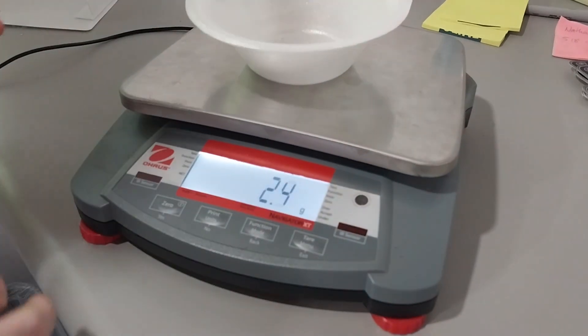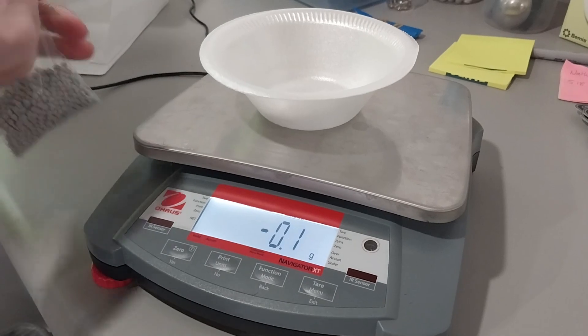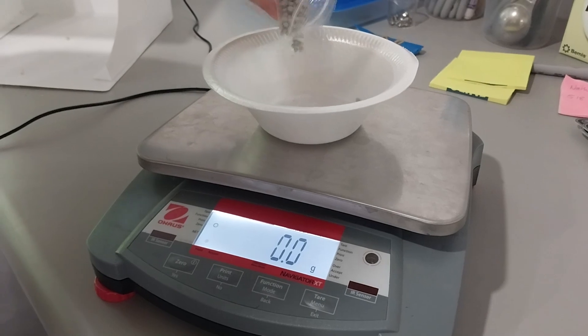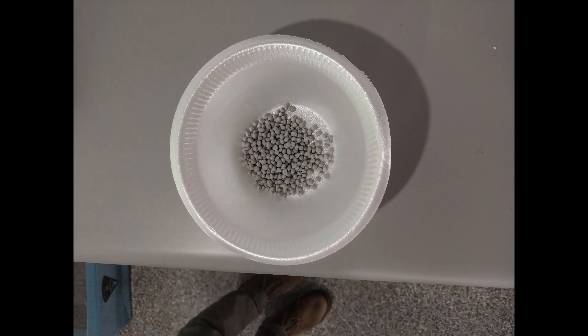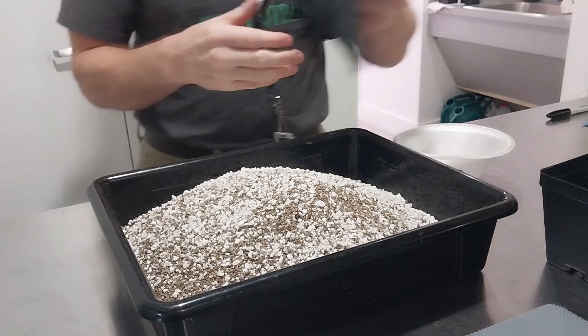Measure out 20 grams of fertilizer. When measuring the fertilizer, first zero the scale with the container, then begin pouring out the fertilizer pellets. The remainder of the fertilizer will be used for the second experiment.